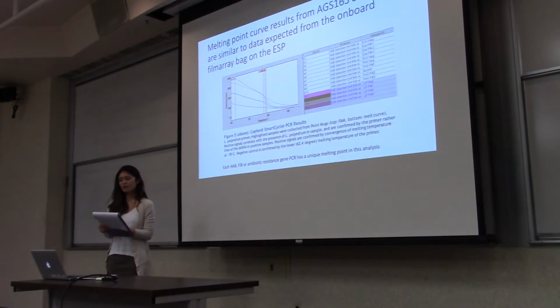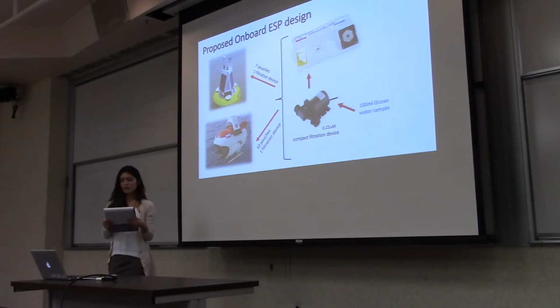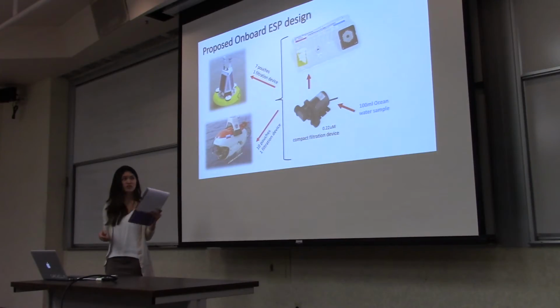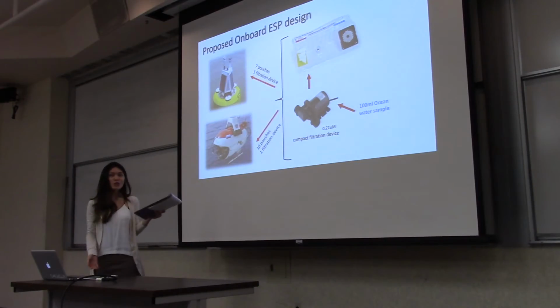So we need to have a network of these kinds of devices for recreation and food production. Our device will test at multiple sites. The testing that has been done in our lab proved that there are these critters at every site we have sampled and tested, but the PCR method took more than a week or 2 to perform just to find these critters, whereas this device will save us so much time because results can be acquired within minutes or even an hour. So, as you can tell, it's highly time efficient. Therefore, more sites can be sampled, and it's local and automated.